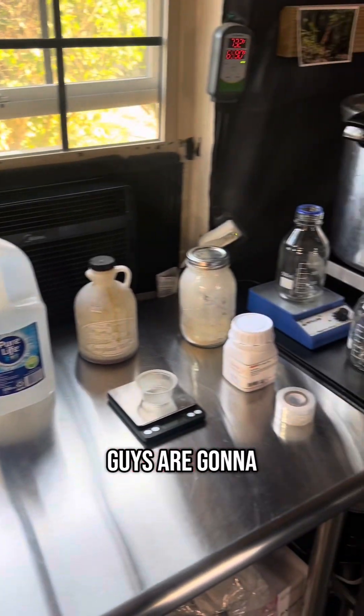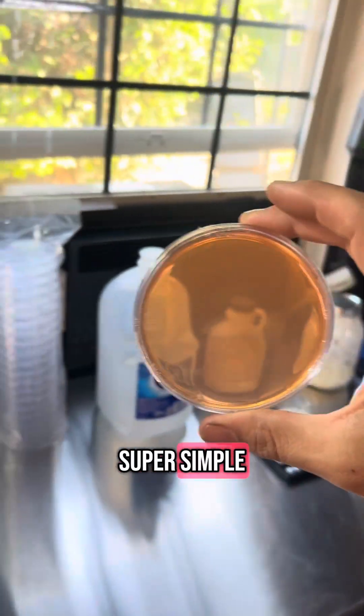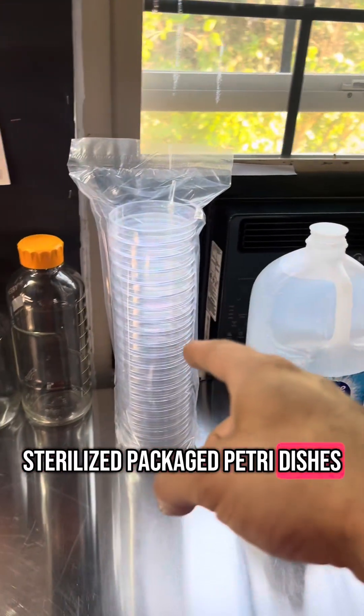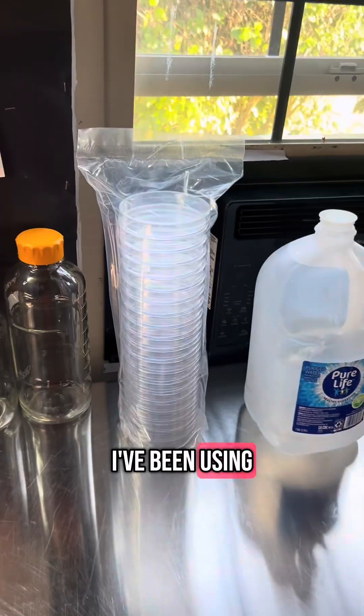Agar plates made easy. Let me show you everything you're going to need to make your own agar plates — super easy and super simple. First thing you're going to want to get is some sterilized packaged petri dishes. You can get some off Amazon; I'll link two links that I've been using and they work great.